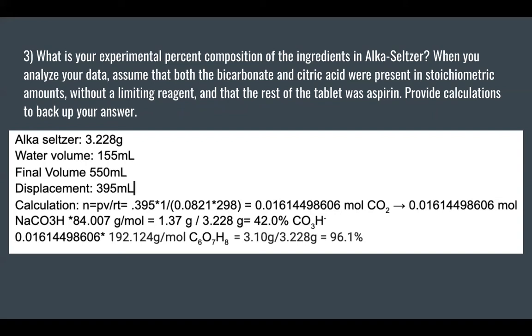I calculated the percent composition of sodium bicarbonate to be around 42%. I did this by calculating the number of moles of carbon dioxide from the volume of the bag and multiplying that by the molar mass of NaHCO3.